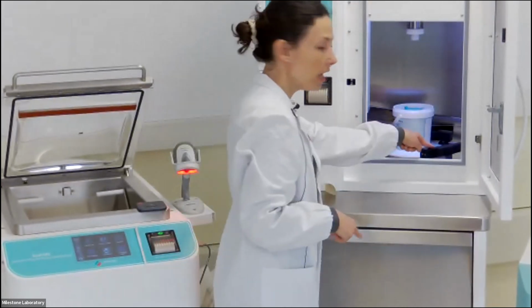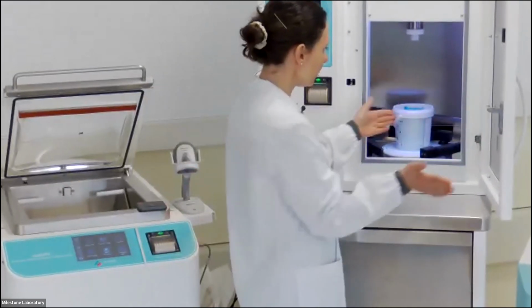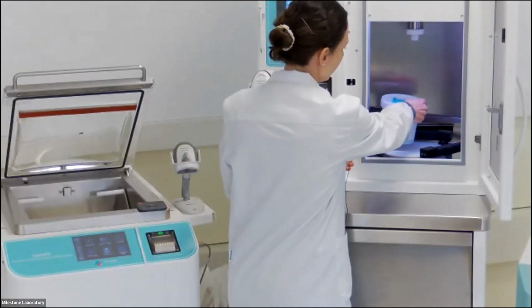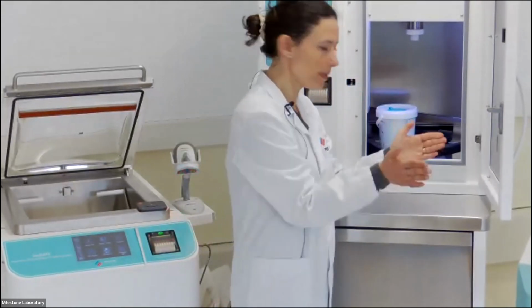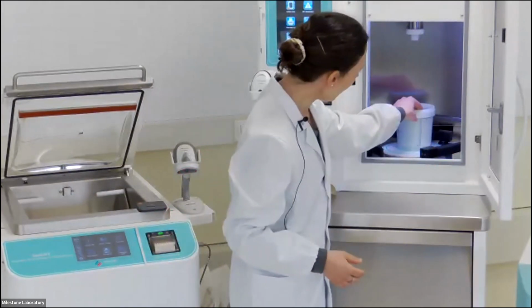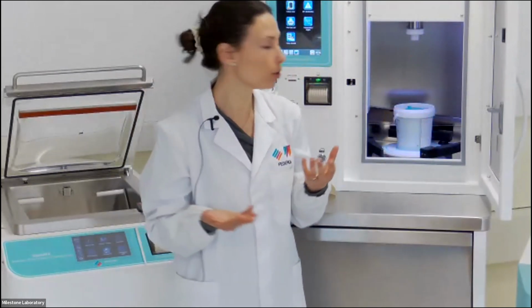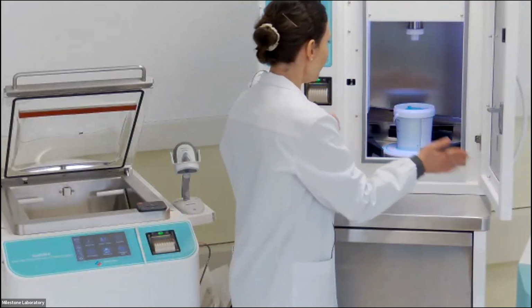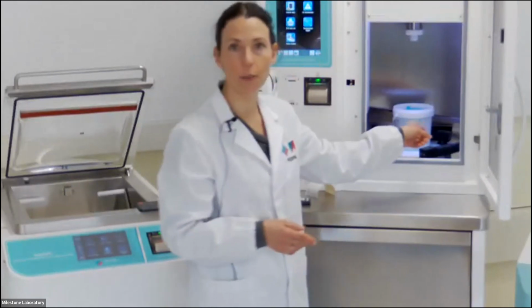Moreover, we have here three spindles that, when the program starts, even consider, for example, imagine that I position the bucket not in the center, the spindles in the beginning of the program will move the bucket and position it in the center of the cavity. The spindles have a second functionality. They will detect the presence of the bucket. So if they detect that no bucket is present, the program will not start, so the formalin will not release.